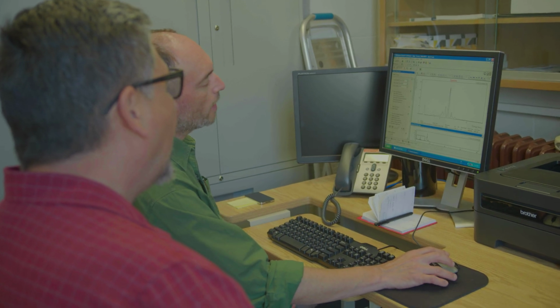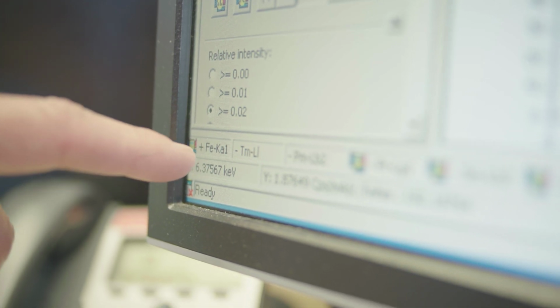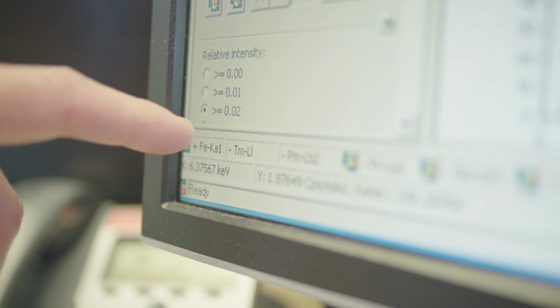Okay. Is the instrument done now? Can we look at a spectrum? Yeah, we can look at a spectrum. I'll try and zoom in here. What we want to do is figure out what each one of these peaks represents. Now, we're very lucky. We have new applications now that make it a lot easier than it used to be. The application is able to immediately tell us that this is most likely, down here in the left, the iron K alpha peak. Yeah, okay.